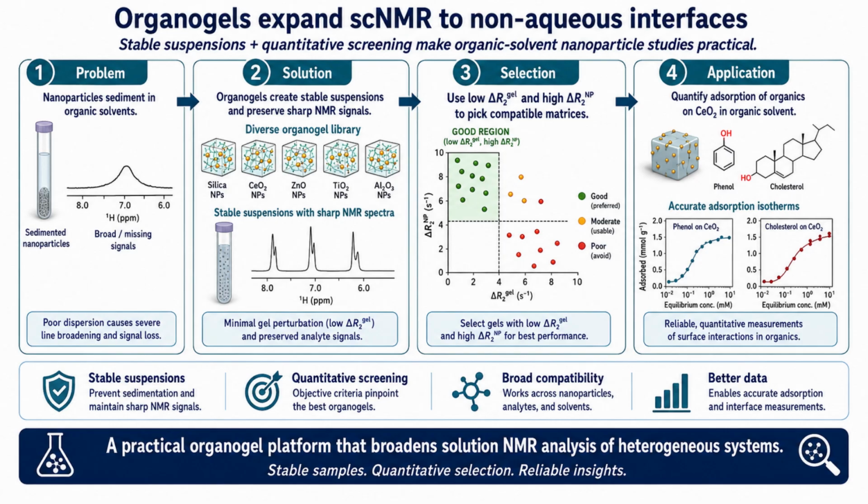Together, these results show that organogels can prevent nanoparticle sedimentation in organic solvents while maintaining the NMR sensitivity needed to detect adsorption. This expands surface contrast NMR beyond aqueous suspensions and provides a practical route for studying nanoparticle interfaces in a much wider range of chemical environments.